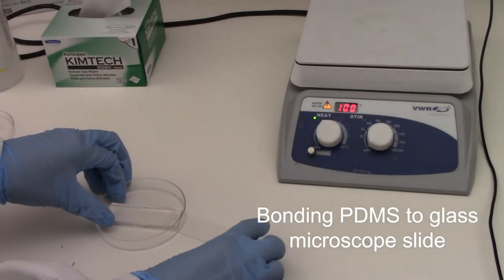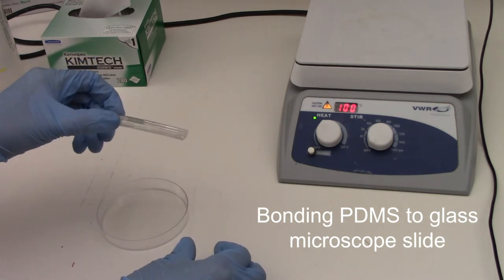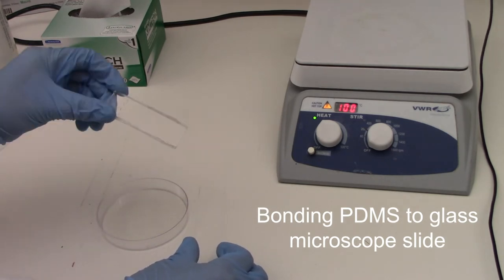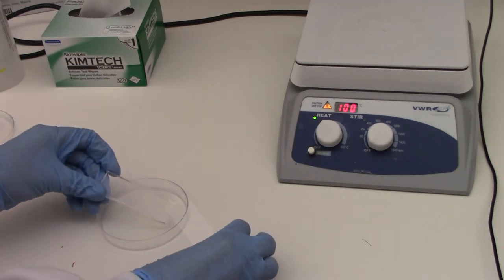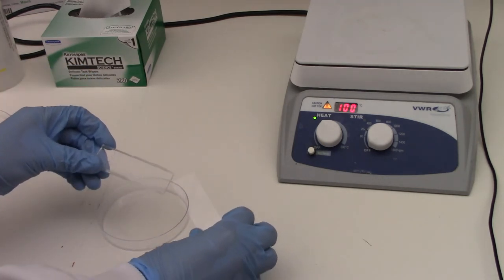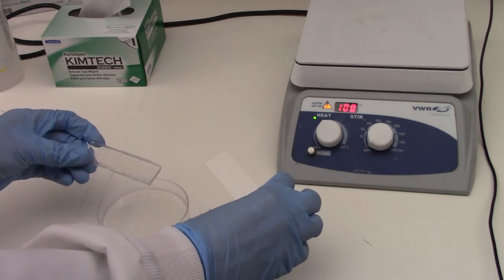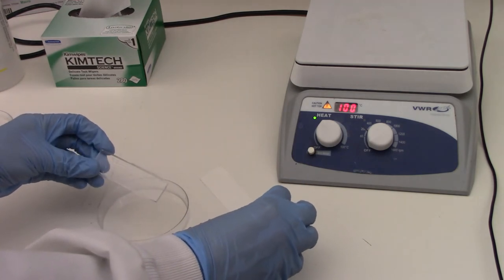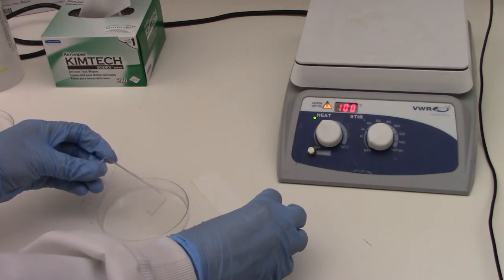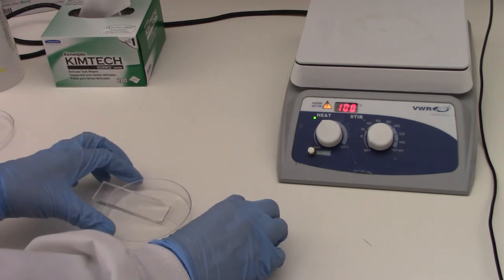Next, we're going to show you how to use plasma to bond this PDMS, already complete PDMS chip to a glass slide. And we'll do that by first cleaning the PDMS and the glass, baking the glass for about five minutes at 100 degrees Celsius. And then applying a plasma treatment for 60 seconds, bonding the two pieces together and putting them in a 90 degrees Celsius oven.